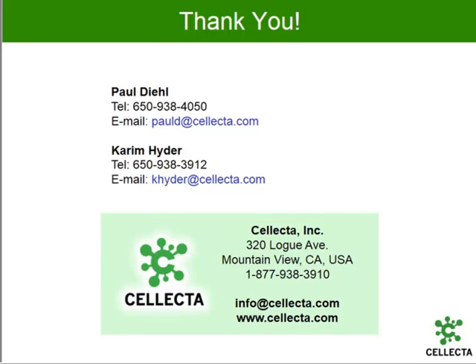Okay, perfect. You can try one more, though. Okay, one more. How do you design your sgRNA to mitigate the risk of off-target effects? Yeah. Well, it's difficult to do that because no one is really clear even at this point how the off-target effects with sgRNA occur and what type of off-target effects there are.